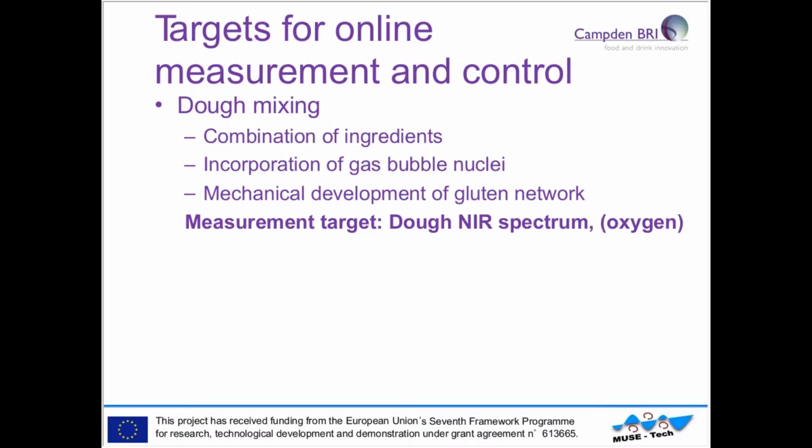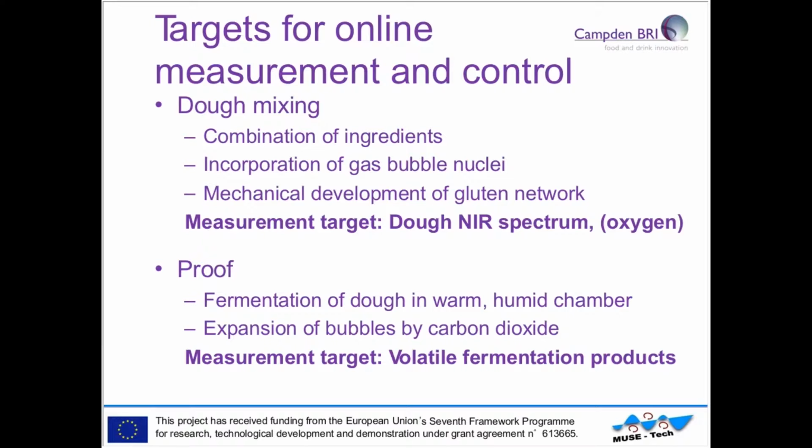And our measurement target here was to take near-infrared spectra of the dough online as it mixes, and to see whether those can tell us something about the state of the dough to help control the mixer. We also planned originally to measure the oxygen in the headspace, because oxidation is an important process here, but I won't be reporting on any measurements of that.